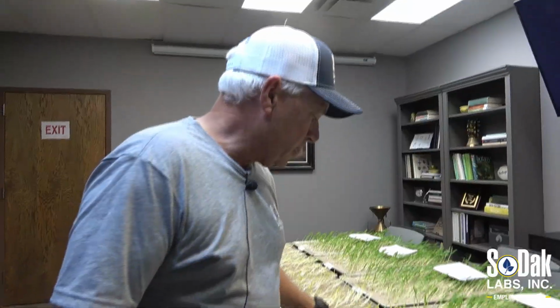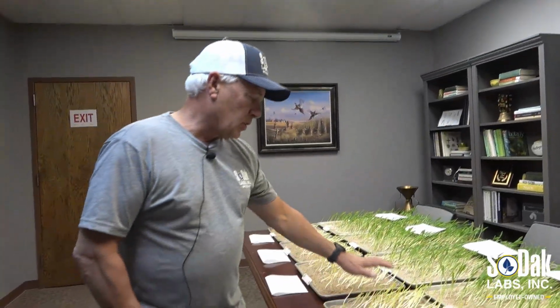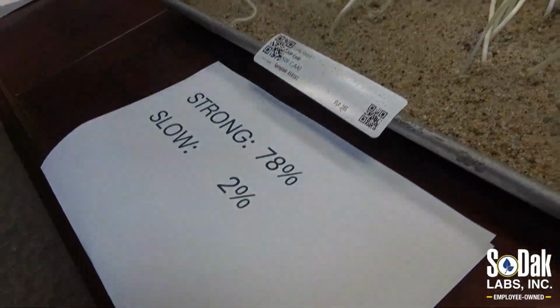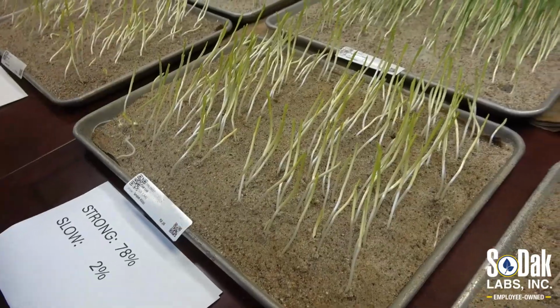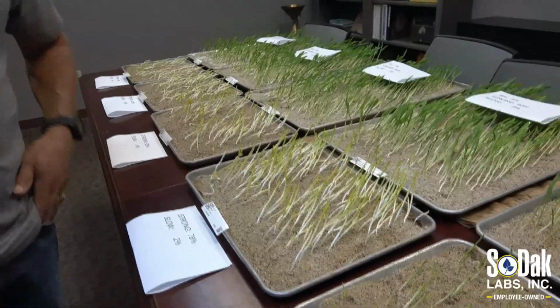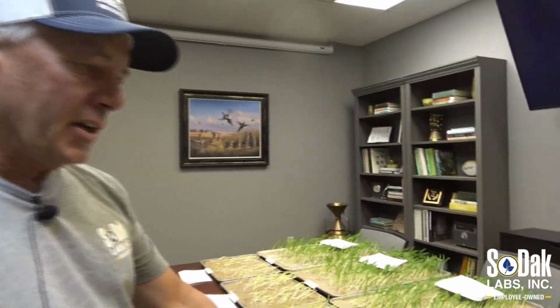When we compare our strong lot here, this has got an 80% tray cold, so 50 Fahrenheit imbibition under aerobic conditions. Pretty good seedling uniformity there, but that lot had tested a 96 warm, and I like to say, in corn and sweet corn, the warm pulls everything up. So we really have a 96 warm and an 80 cold, which is a pretty good lot of sweet corn. This is a pretty stressful test for sweet corn.